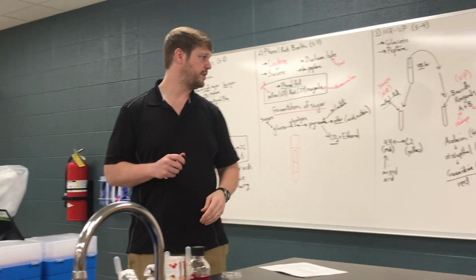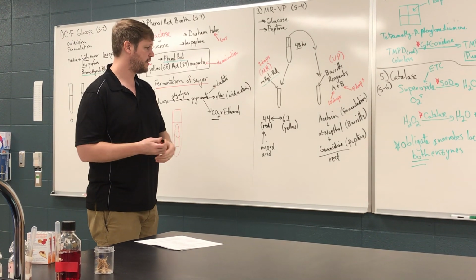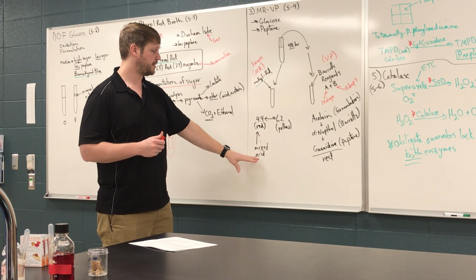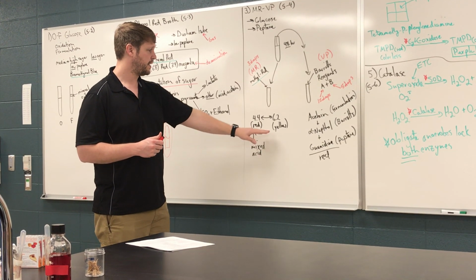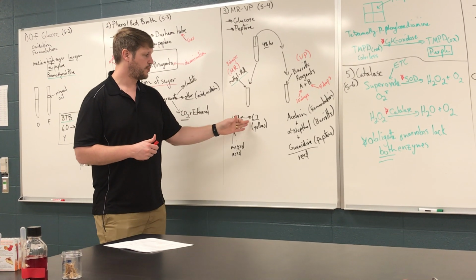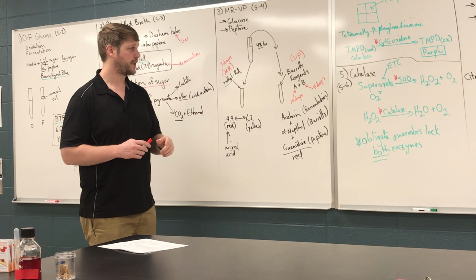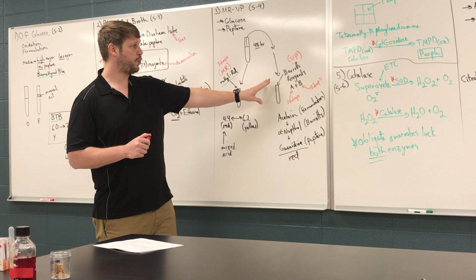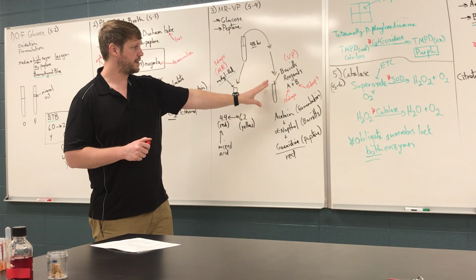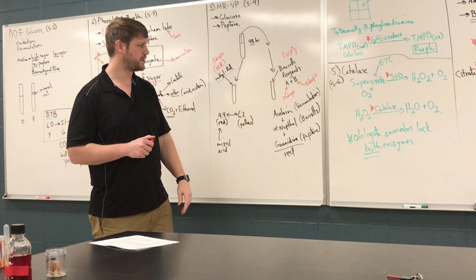And the basic idea here again, methyl red is a pH indicator. So if the organism is producing what we would call mixed acids, you're going to get a really bright red. If it's orange to yellow, that's a negative for the methyl red test. The VP portion, if you add the Barritt's reagents A and B, you need to wait just a little while.